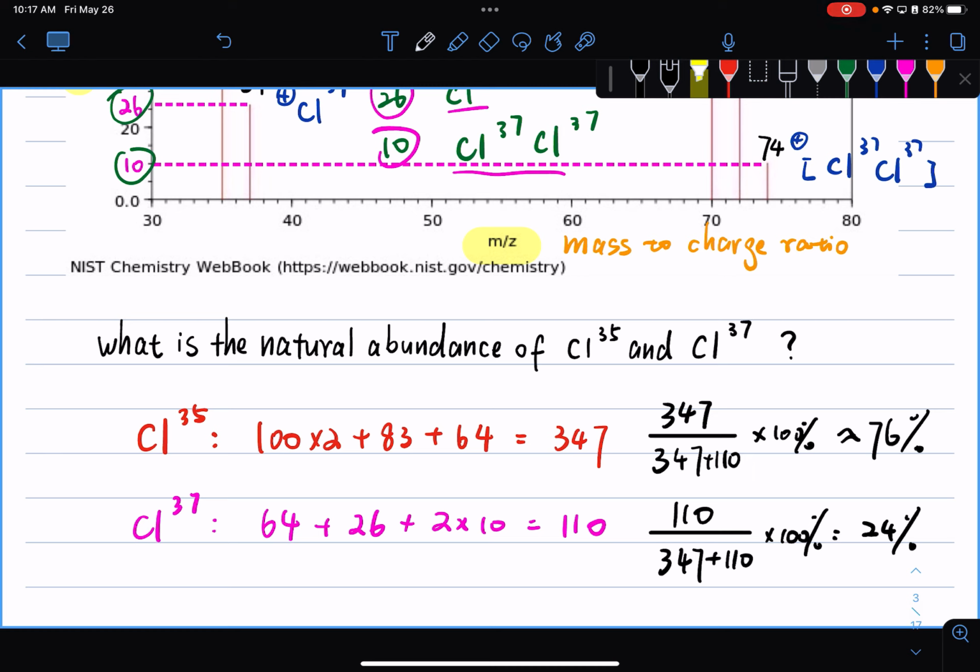All right, so that's our first and second topic, the theoretical background. So the idea here of the theoretical background is pretty straightforward. You start from a molecule. You shoot that molecule with a beam of electrons, and that molecule will crack down into different fragments. And depending on the mass of those charged fragments, they reach your detector at different times.